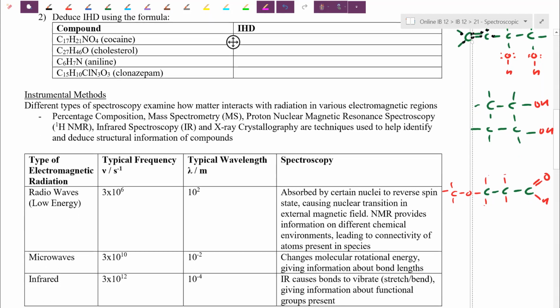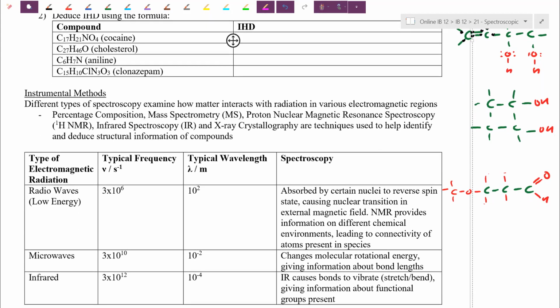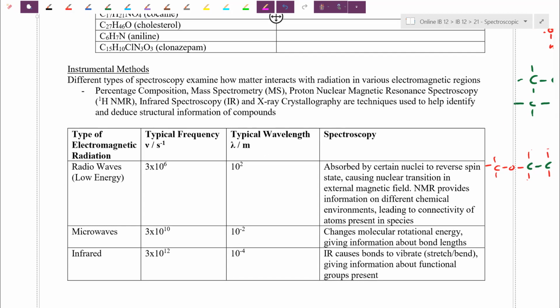As we start looking at different chemical instruments to actually analyze molecules, different types of spectroscopy, in general, we're trying to send in radiation of different energies, and we're seeing how the matter actually interacts with this radiation. Fortunately for us, the whole EM spectrum is a much wider range. We've been doing a lot of visible and UV spectroscopy. When we did things like absorption and emission studies, like how much energy do I need for an electron to promote itself, to jump from shell to shell? That gave you information about electrons, but that was relatively a big size.